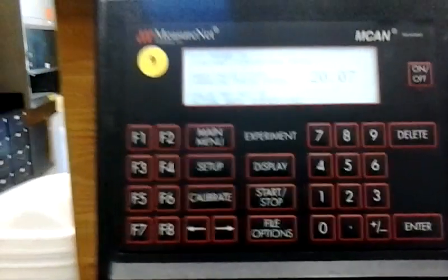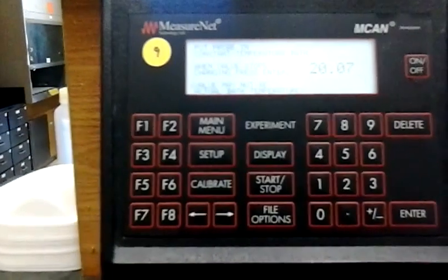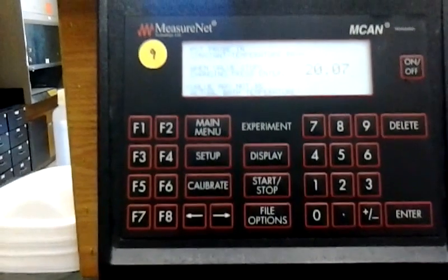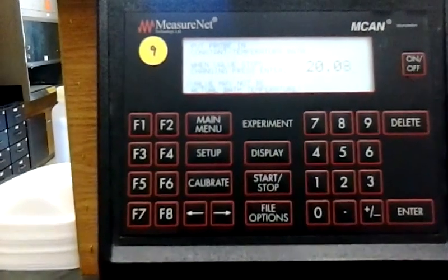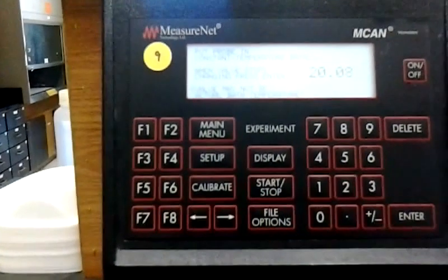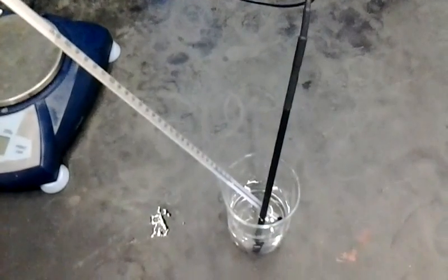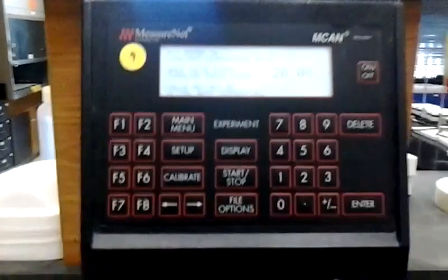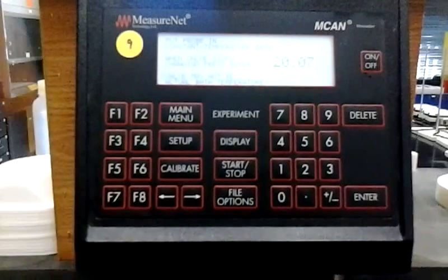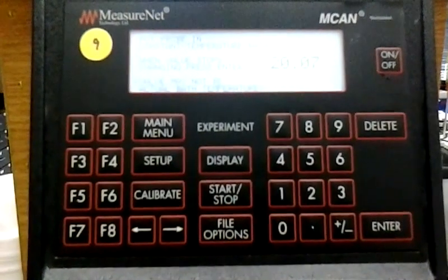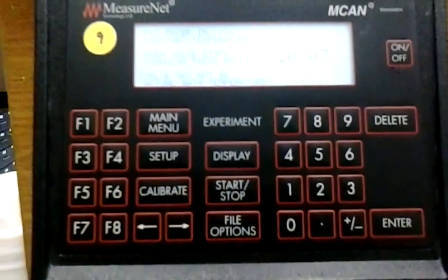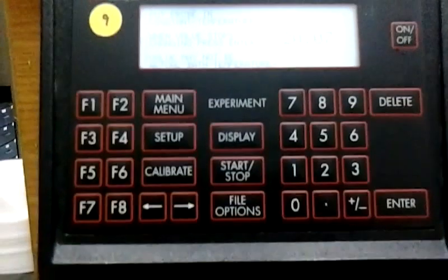The next thing it asks you is to put the probe into the bath, which we have already done. So as you see down here, the temperature probe is in the water bath. And what you do is you wait for the temperature on the screen to stabilize.